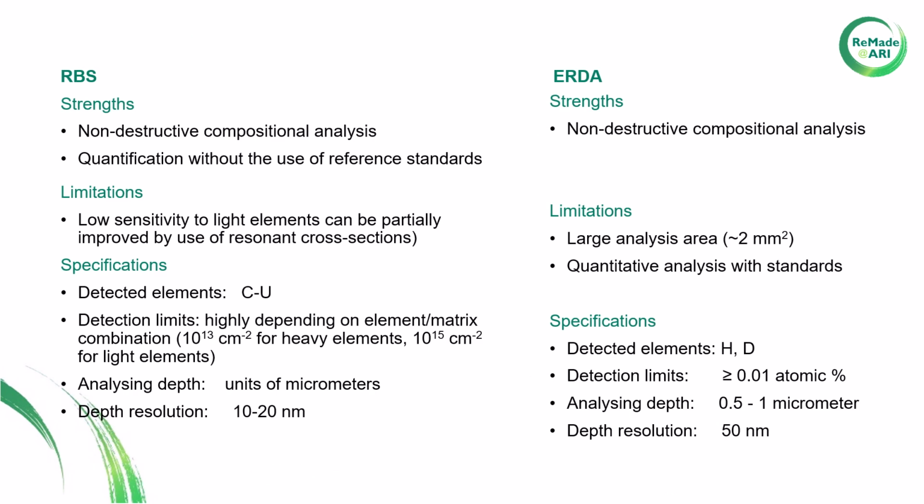RBS and ERDA are non-destructive ion beam techniques. RBS is unique in that it allows quantification without the use of reference standards, unlike ERDA, but it is limited by low sensitivity to light elements. Sensitivity to light elements can be partially improved by use of resonant cross-sections.